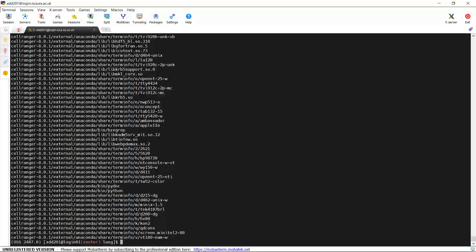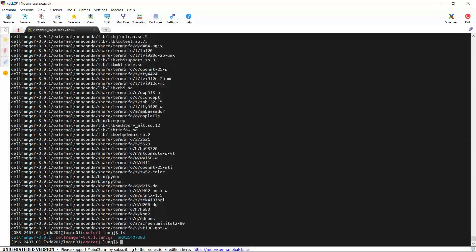It is done. If we use the ls command and look at the files in my lung folder again, you can see now we have a folder called CellRanger 8.0.1. In this folder we have the CellRanger software to analyze the raw sequencing data.